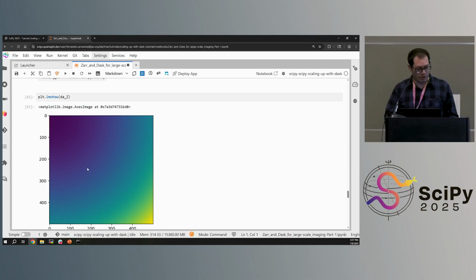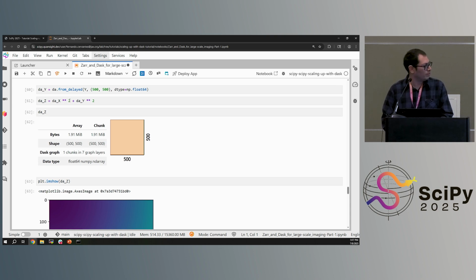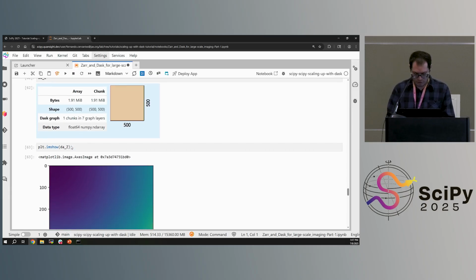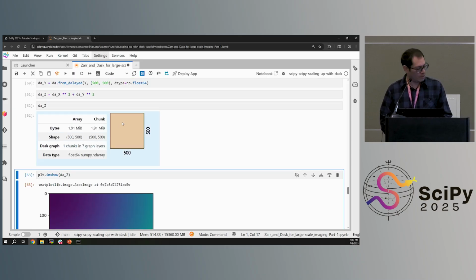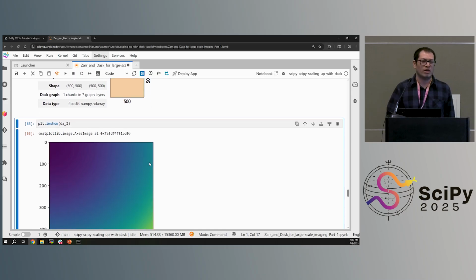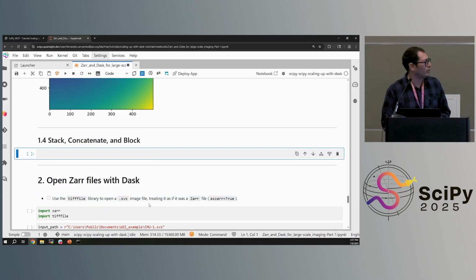Again, like any other NumPy arrays, you can apply math operations. So I have here some examples. I'm going to compute the sum of the D3, so np.sum of the D3, and let's check what it is. So this is also a Dask array that is still not computed until we explicitly call the compute method of D3 sum.